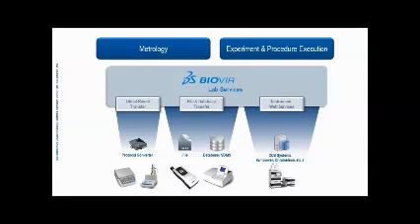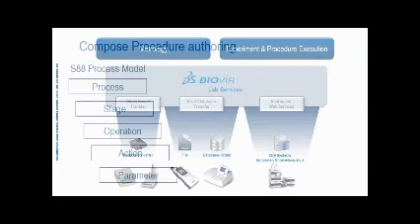We're working on that one though, and that's one of the things you saw with Tetra Science the other day, because they're going to actually be able to provide us an ADF file for the GE ACTA, and the GE ACTA will basically talk to Tetra Science. They'll give us an ADF file. We'll be able to pull that right into the system. So again, we can work together as partners in this network as well. It doesn't have to all come from BIOVIA.